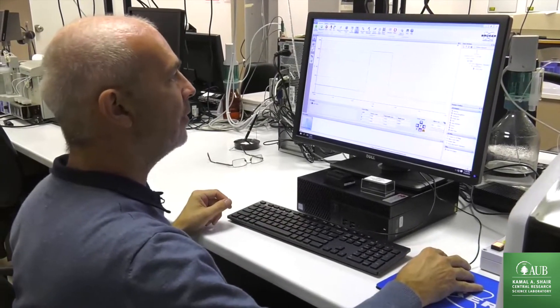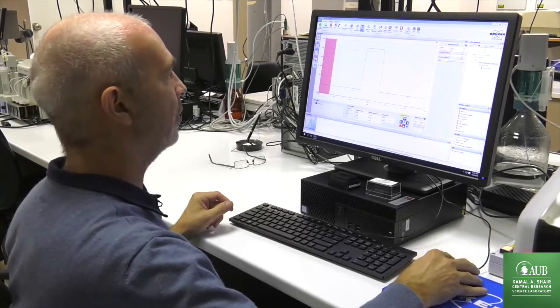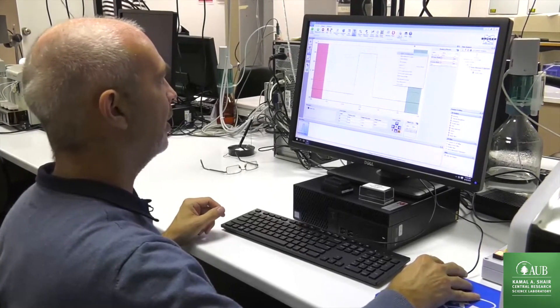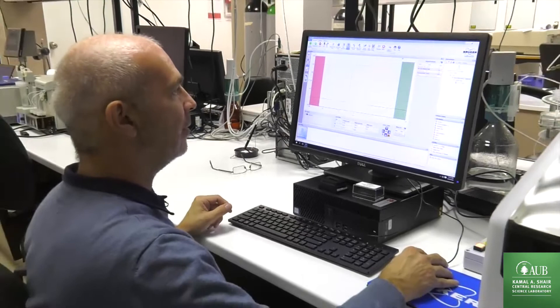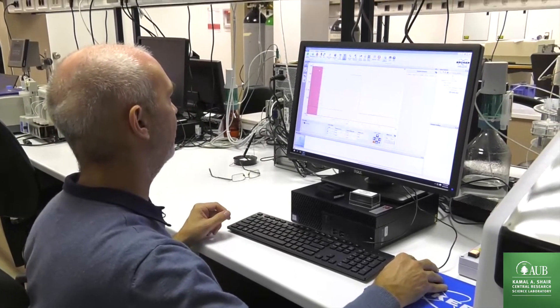So we go to terms removal, place our cursors and say two point linear leveling and then we go to profile stats and define how we want to measure the step height.